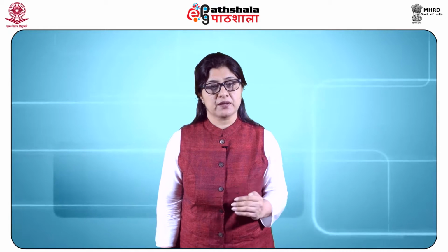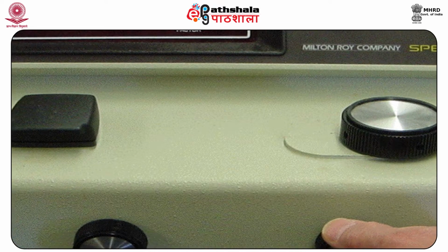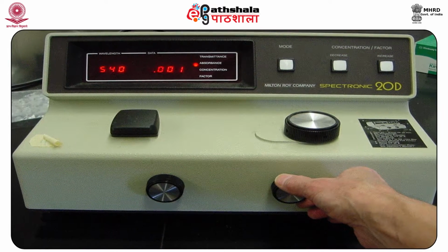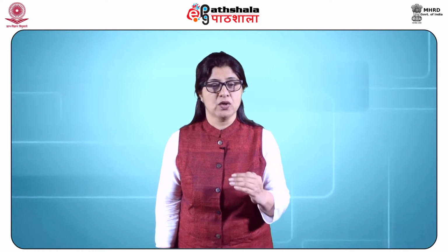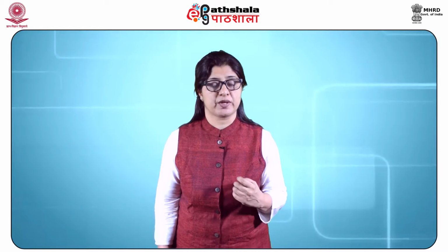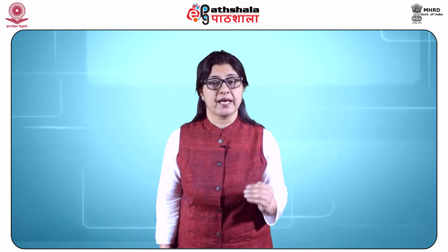The most common method of detection in enzyme assay is the spectrophotometric assay. This assay uses a spectrophotometer, which is a machine used to measure the amount of absorbance of light by a substance. It then combines the kinetic measurements and Beer's law by calculating the appearance of product or disappearance of the substrate concentrations. The difference between the initial absorbance and the final absorbance is directly proportional to the amount of substrate. This method is simple, non-destructive, selective and sensitive.